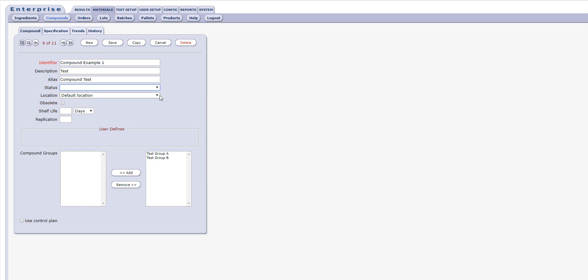The user may also mark a compound obsolete, assign a shelf life value in days or weeks via a drop-down, and mark the compound with a value in the replication field. You may also add or remove compound groups and mark whether the compound is subject to a control plan.